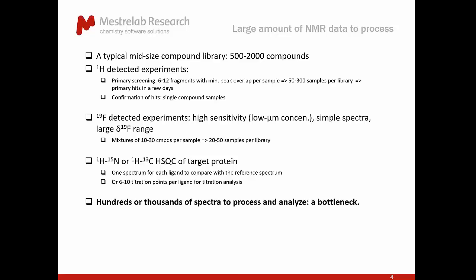We have been working to develop software tools to improve the efficiency of data analysis for FBDD for the past 7 or 8 years. And now we are very proud that we're providing tools for almost every aspect of this workflow.